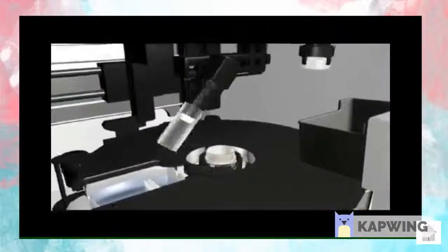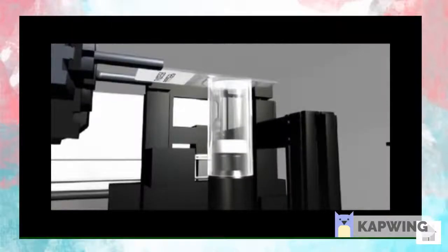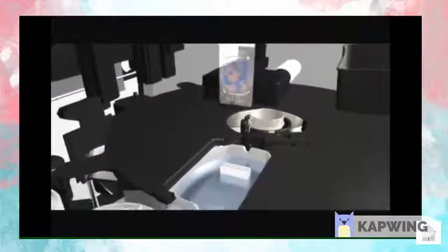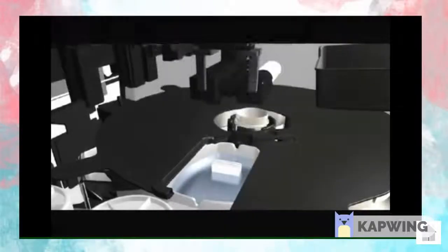Following cell collection, the ThinPrep Pap test filter is inverted and then gently pressed against the ThinPrep microscope slide. Cells then adhere to the slide in an even distribution in a defined circular area. Once the sample is processed, the resulting slide is placed into a standard staining rack within an alcohol bath.